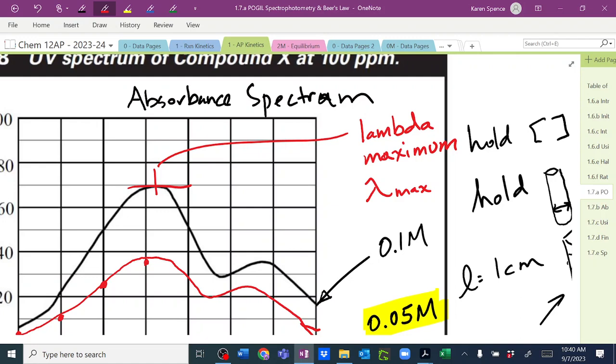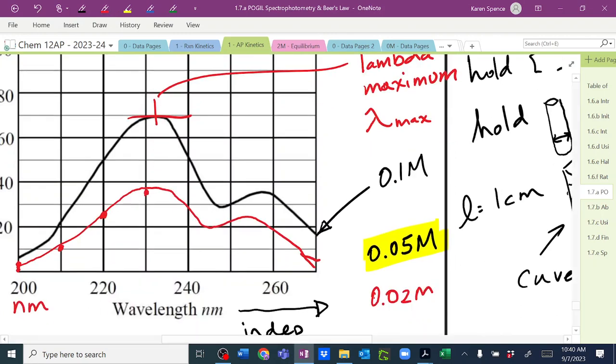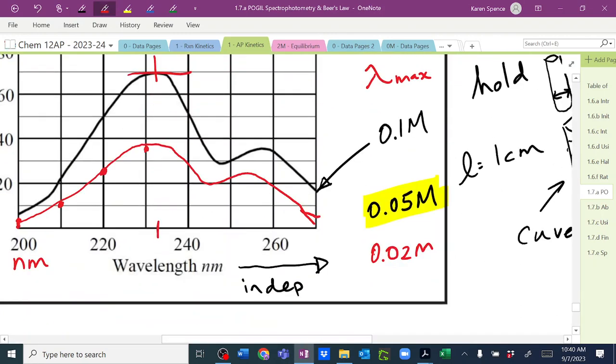And so the absorbance will get less and less and less. And if this were crystal violet, we would choose to do that one, where we're measuring the absorbance every few minutes, at a wavelength of about 233 nanometers, because that would give us the best absorbance. We wouldn't sort of bottom out somewhere where we couldn't do that.